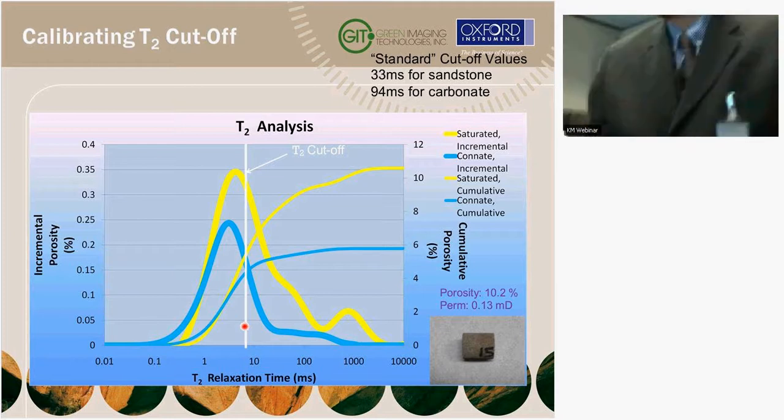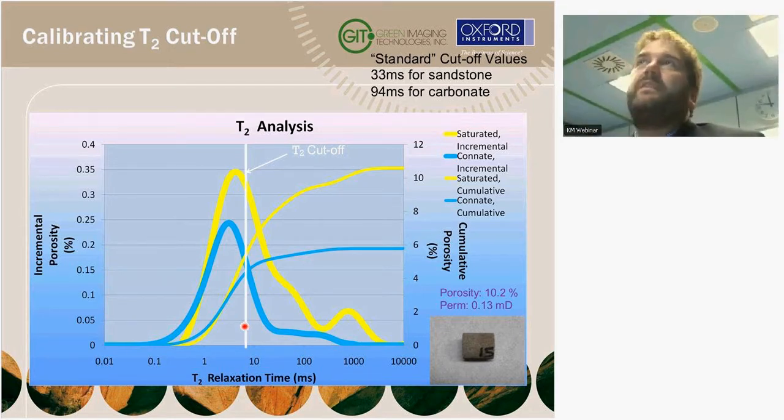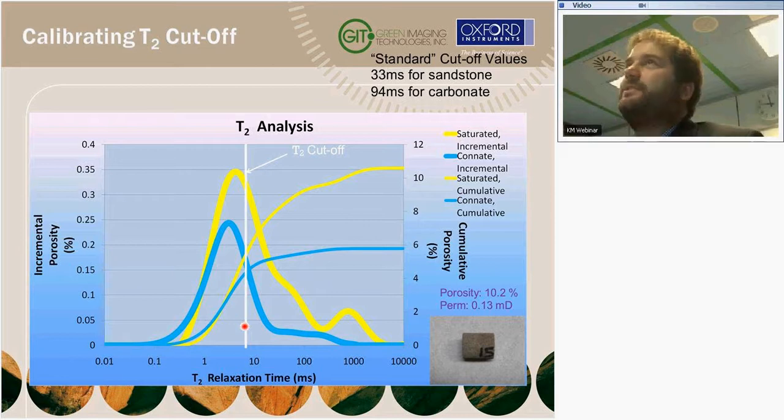Yes, there is a different model other than the hard cutoff. In reality, we don't suddenly come up on a pore size in which all the fluid is going to be bound. It's not that at 1 micron all the fluid is free, and then suddenly it's all bound. That's just not a reality in nature. So there does exist a model which is called a spectral cutoff. In other words, we actually use an equation for the cutoff. It'll be a line which assumes 100% of the fluid is bound at the very short pores, but then will slowly come down into the large pores, called a spectral cutoff.